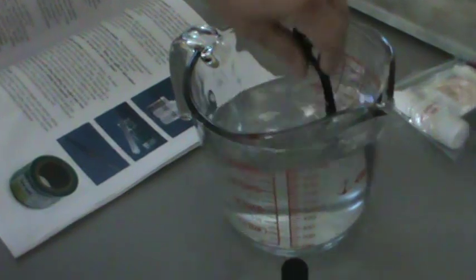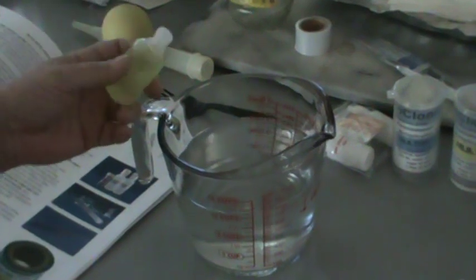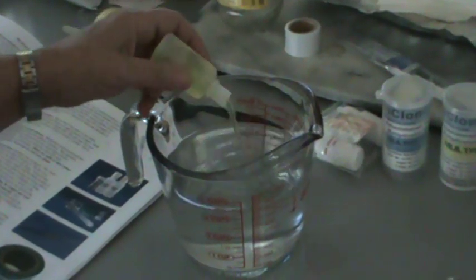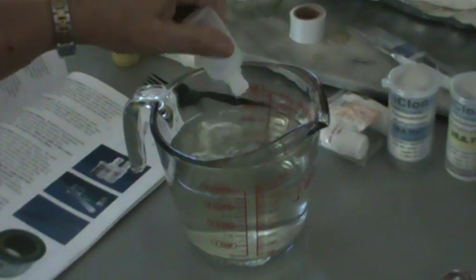I'm learning with y'all. According to the packet, I put this whole thing in there. I'm assuming the PPM and everything is in this, along with the vitamins.